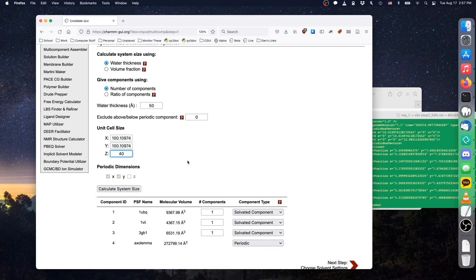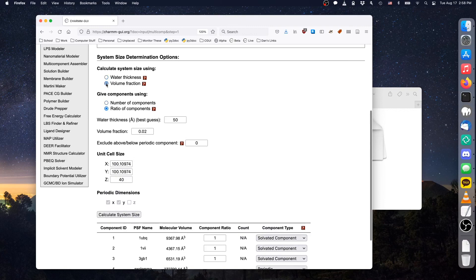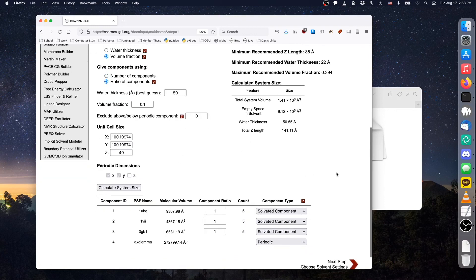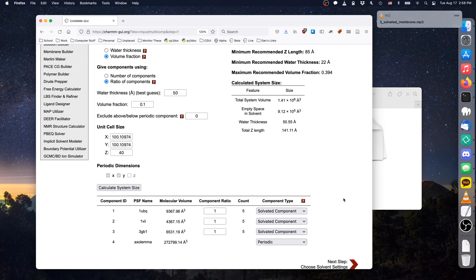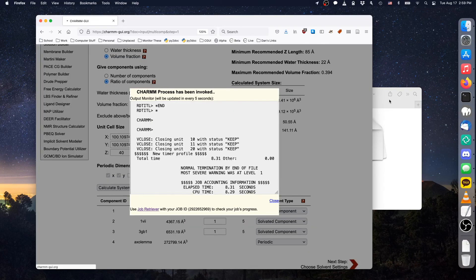As with the previous demos, we will create a system with a 10% protein volume fraction within the solvated region. After calculating the system's size, click next to continue packing. The remaining steps are the same as what was shown in the previous videos. Thank you so much for watching.